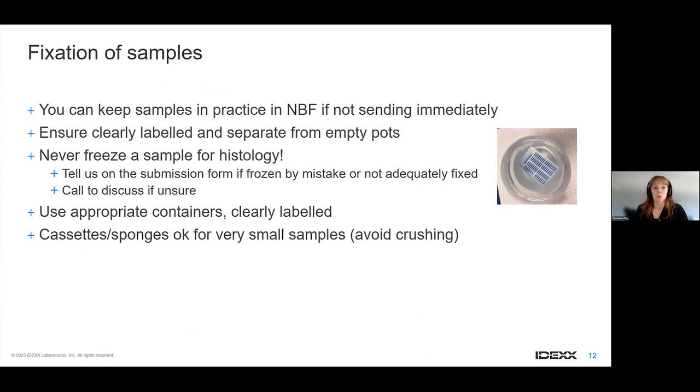One thing to remember is that you can keep samples in the practice as long as they are in formalin, even if you don't want to send them immediately, because the client is still thinking if they want histology or any other tests. They're pretty safe in formalin for a long time. I'm going to give you an example very quickly in a second about clearly labeled and separate pots. So that's obviously very important.